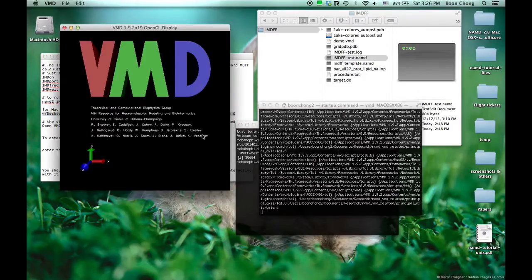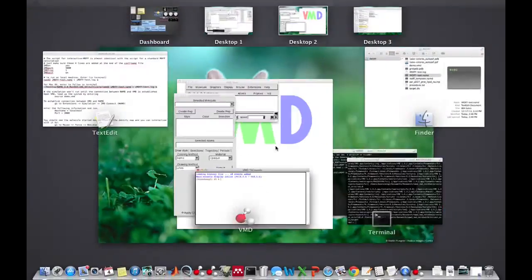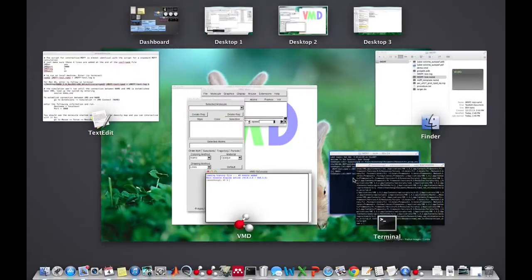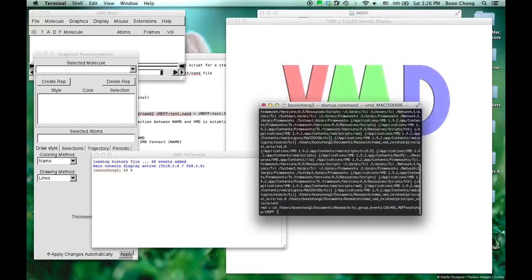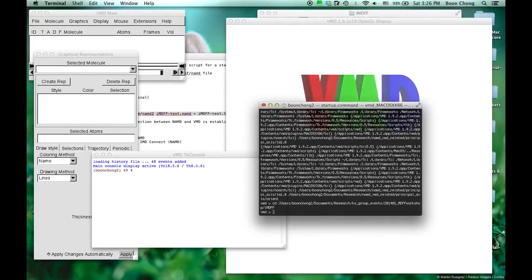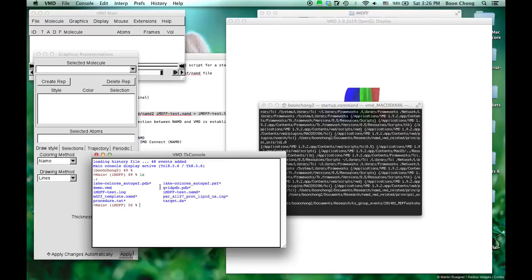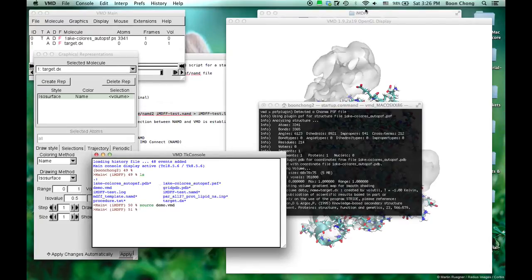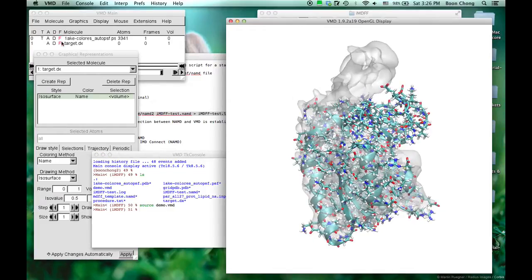So let's open up the VMD session. And then again, always go to the folder. That's where you find all the files. Load it up very quickly, and then we will be able to see.